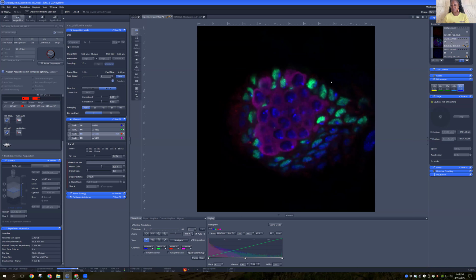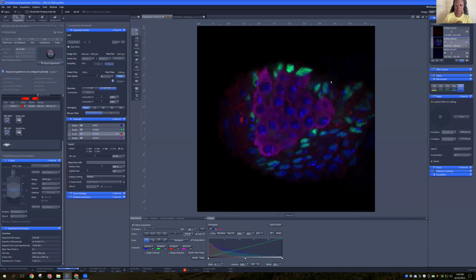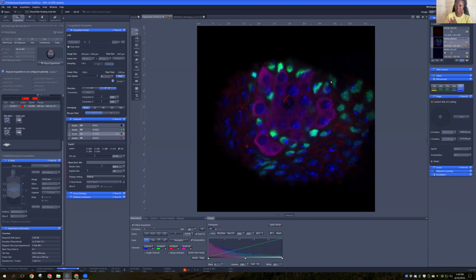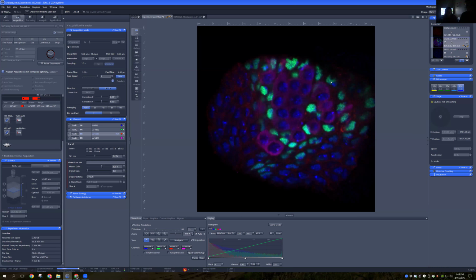And while we're waiting for those responses, if they choose to share that, I did want to go back up to another question from Raja a bit earlier. The question was, with the slices, when you were talking about the thinness of the slices that you needed, is this effectively tomography? So I think I know the answer to that, but I'm actually going to turn it over to Jess.